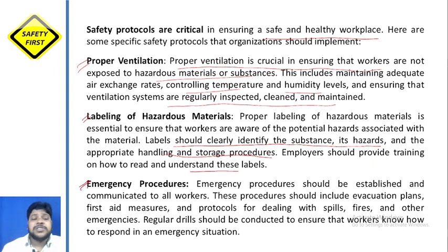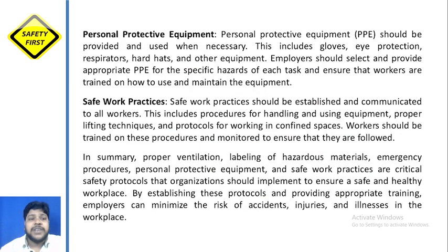Emergency procedures are very important. Emergency procedures should be established and communicated to all workers. These procedures should include evacuation plans, first aid measures, and protocols for dealing with spills, fires, and other emergencies. Regular drills should be conducted to ensure that workers know how to respond in an emergency situation. So all these aspects are very important.